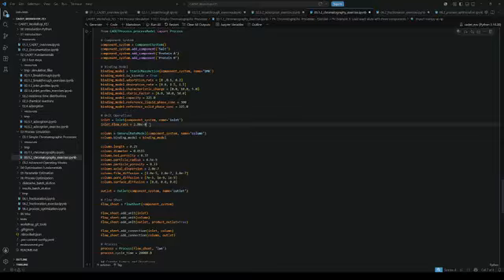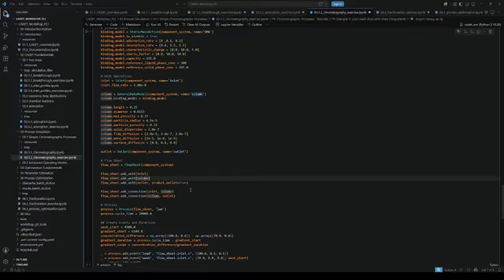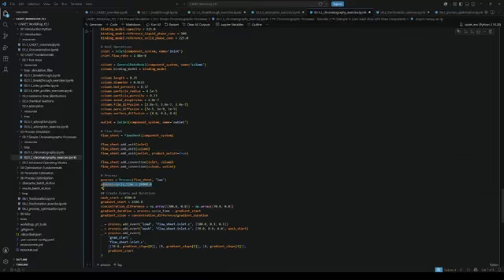We then define a flow rate, and now here for the transportation model, we are choosing general rate. General rate means even more complexity piled on top. We now also have a diffusion inside of the pores, and a diffusion on the surface. However, the diffusion on the surface we turn off by putting the values to 0. All right, we again have an inlet-outlet column system. We connect them correctly, and then we determine a cycle time.